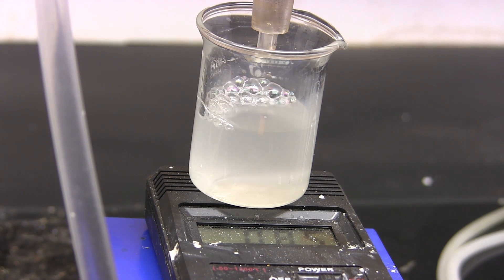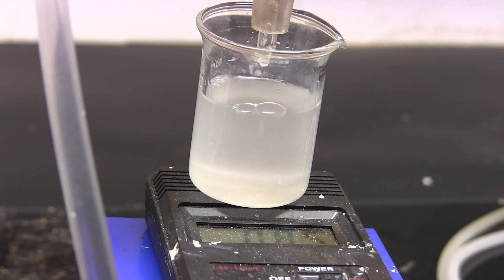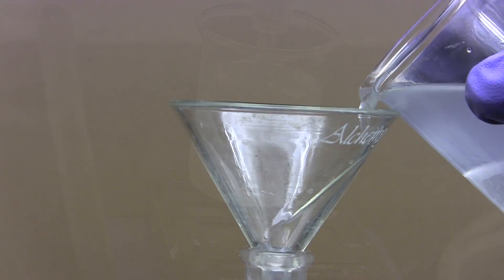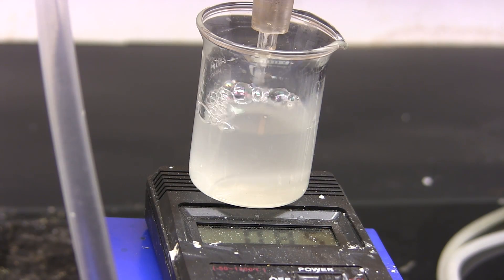This is extremely useful and we can exploit this for such applications as removing most of the water from an organic sample. Just boil it out, pour the organic layer back into the boiling flask while separating the water and boil it out again.